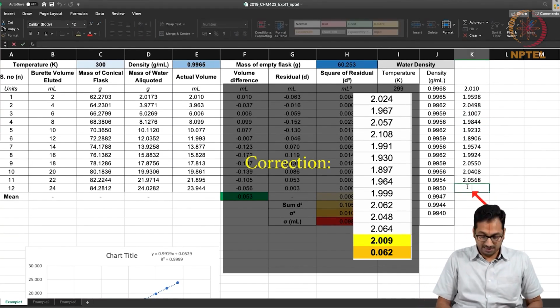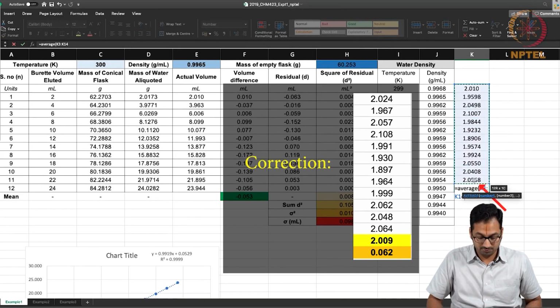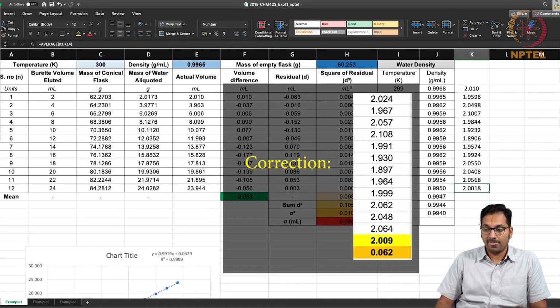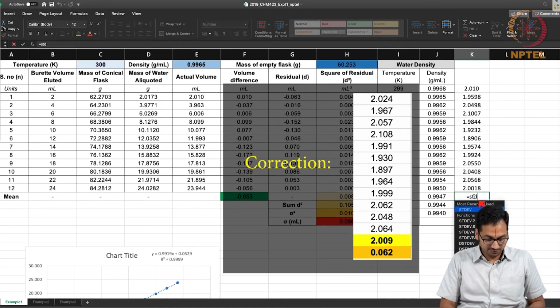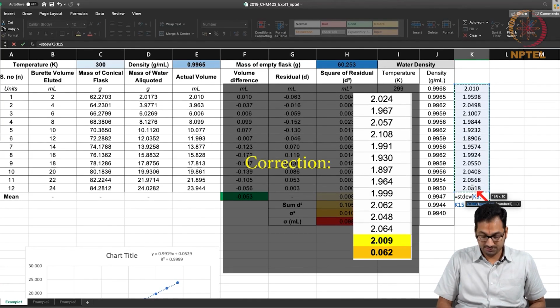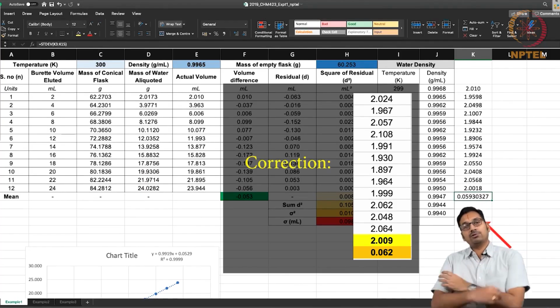So let's try to take the average that comes up here, and then the average will help you understand how accurate you were. You wanted to add 2 ml and you are actually at 2 ml, and you should be able to even get the standard deviation of this measurement. Let's try to see how different it is from the standard deviation that you have measured. If you are able to see, the fitted value gives 0.0529, and that's somewhere close to what you are getting here.